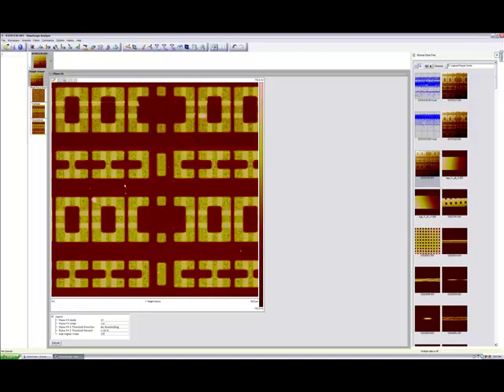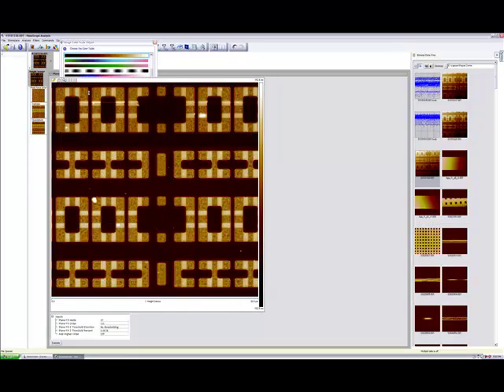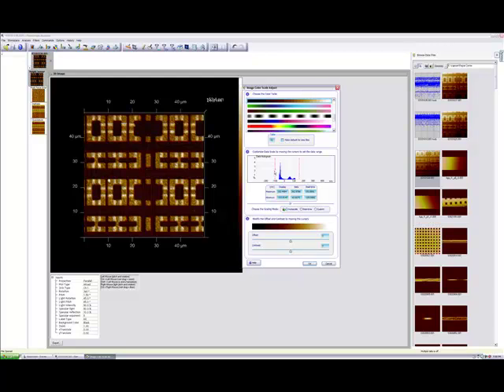Boom. Now we go to our 3D display. We can change the color scale by right-clicking on the color bar. Adjust maybe to the more familiar table 12. Then we display it in 3 dimensions with an artificial light source. Change the orientation by either using the mouse or typing in the appropriate viewing parameters. We can adjust the histogram.